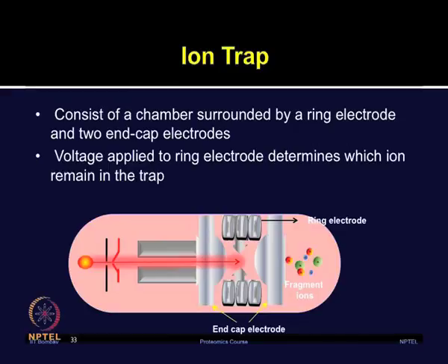Theoretically, the ion trap can provide MSn analysis and it can also provide a mass filter.